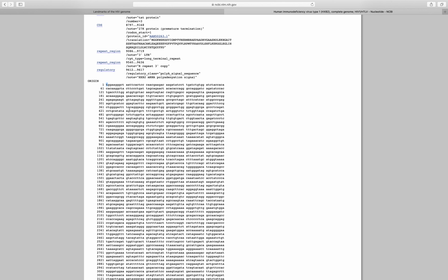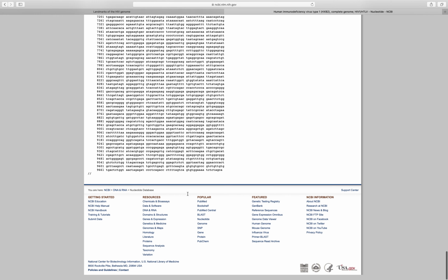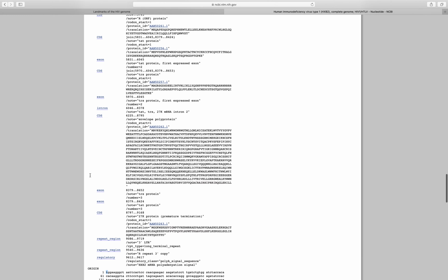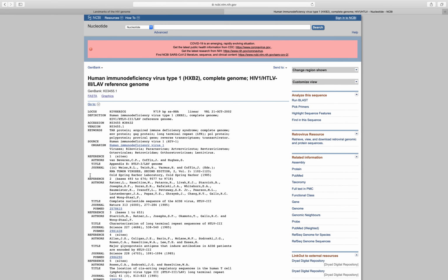This was actually a very, very common practice, understanding that yes, this is supposed to be coding for RNA, but whenever we're using this for different applications, it was common to convert it back to a T, which is the DNA sequence, so the coding DNA sequence. And then we have this double slash, which is the end of the file, which is useful if you're trying to search for what is in the entire file.